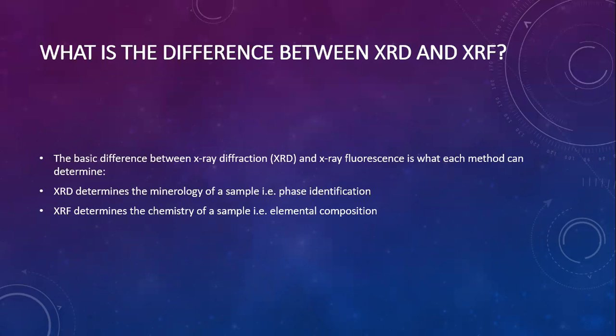Now, what is the difference between XRD and XRF? The basic difference between X-ray diffraction and X-ray fluorescence is what each method can determine. XRD determines the mineralogy of a sample through identification, and XRF determines the chemistry of a sample, its elemental composition.